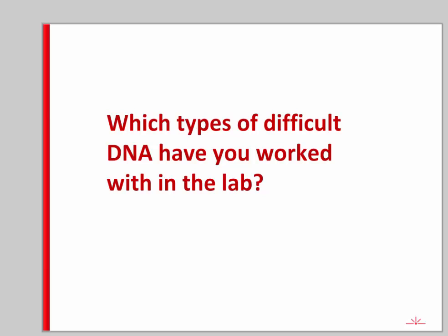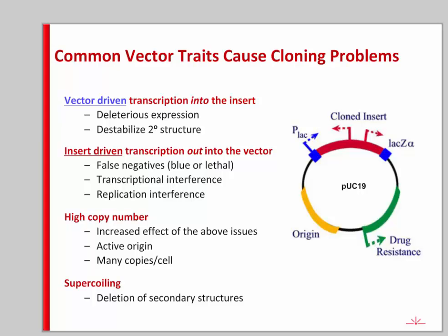It's interesting that not many people had problems with AT-rich DNA. We've actually had quite a few customers contact us about not being able to clone that. I will talk a lot about AT-rich DNA, but also repetitive sequences, GC-rich, and toxic genes. It turns out that a lot of the problems experienced with these DNAs are not necessarily the DNA itself, but the features of common cloning vectors.